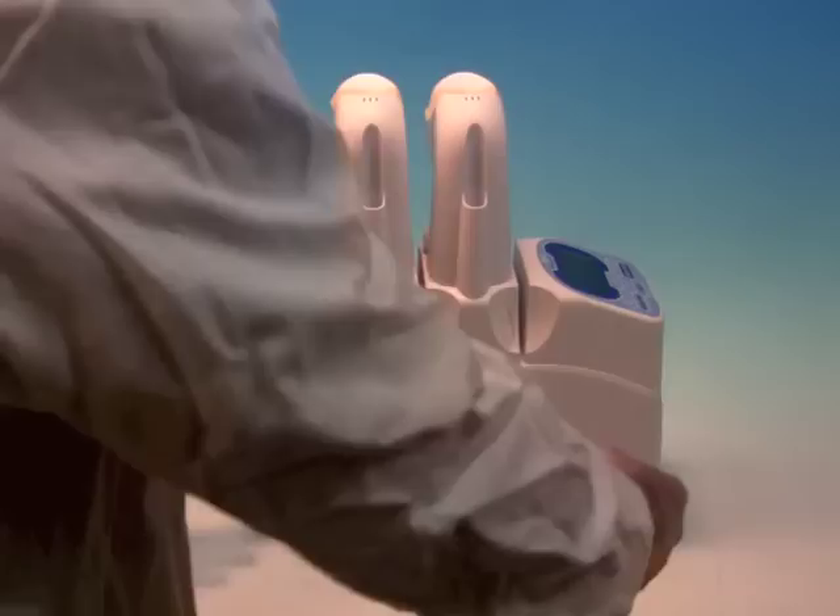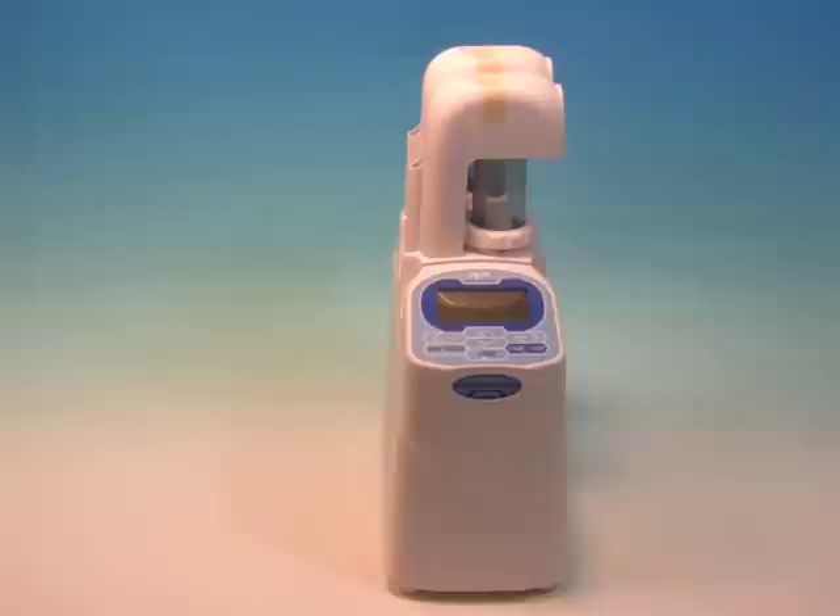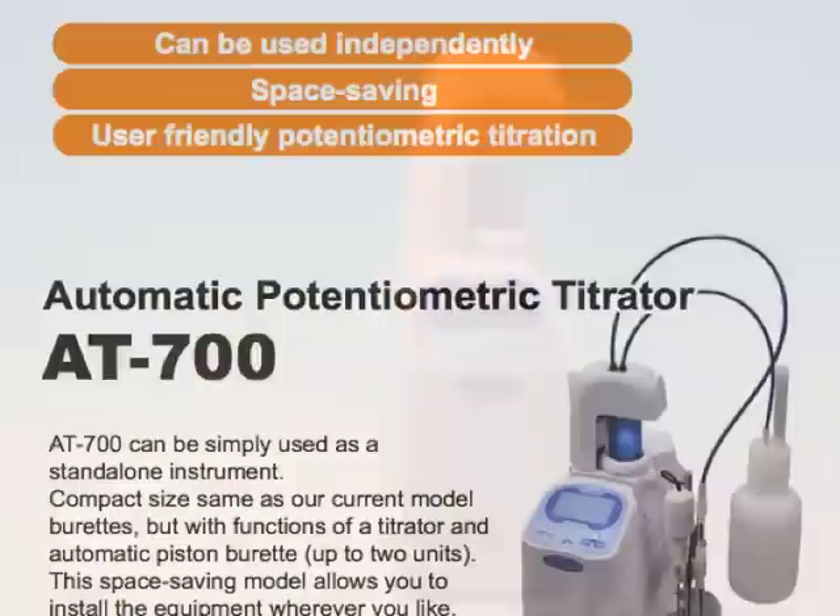Although the AT700 is compact by design, this unit can be expanded to work with a mini sample changer and can also be connected with up to eight chained automatic piston burettes.